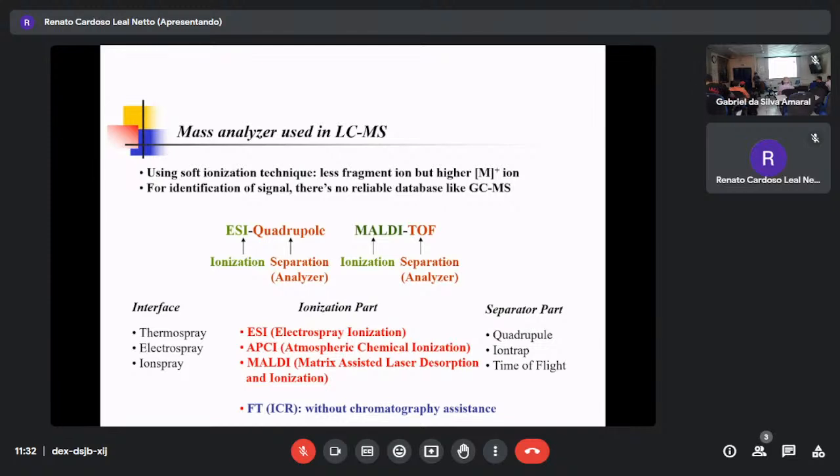And also targeted analysis. Now, why is the imaging technique important? One is our current metabolomics, which I think you mentioned a long time ago. Metabolomics, as I said, is a kind of snapshot. Now I take the snapshot, but the problem is there are two factors we cannot resolve. The second one is time.